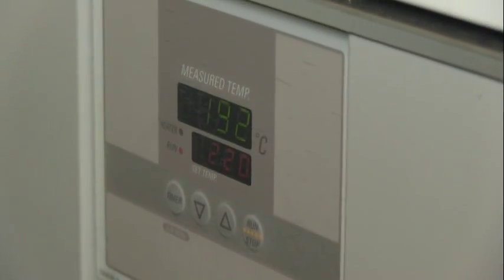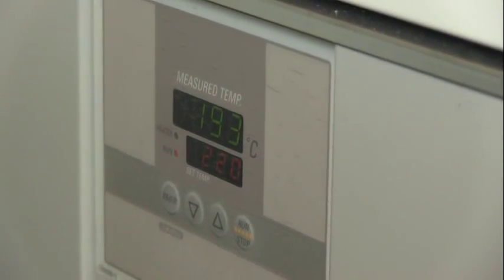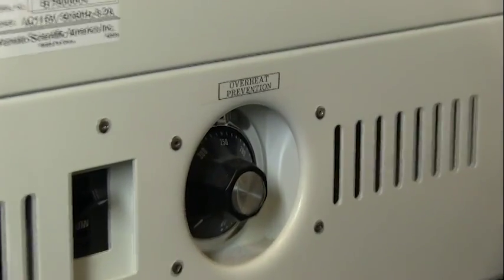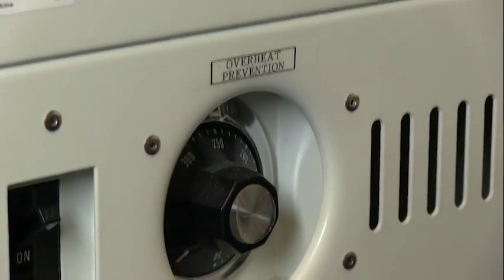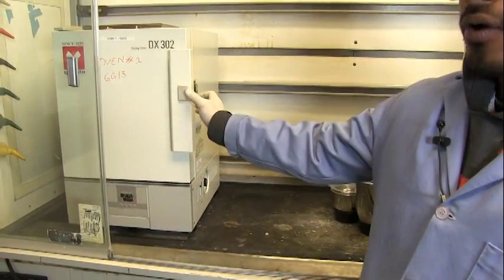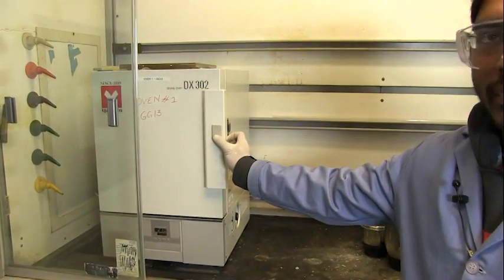Defective temperature controls or operator inattention can be the cause of dangerous overheating in an oven. In order to prevent dangerous overheating, the best practice is to use this high temperature limit controller. In addition to that, you should regularly check your heating devices during a reaction.